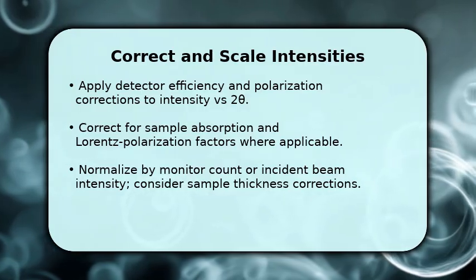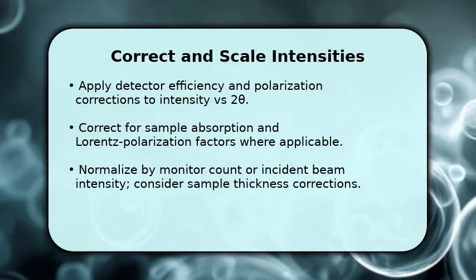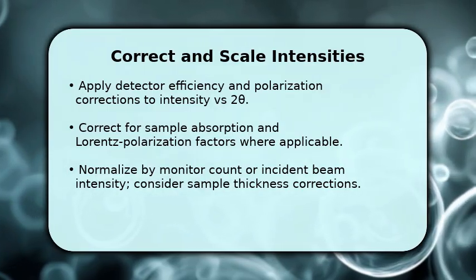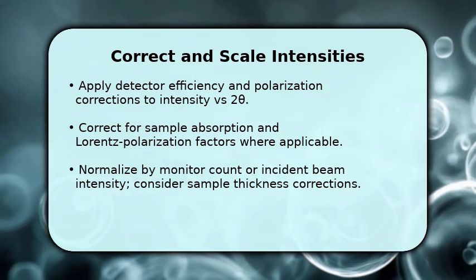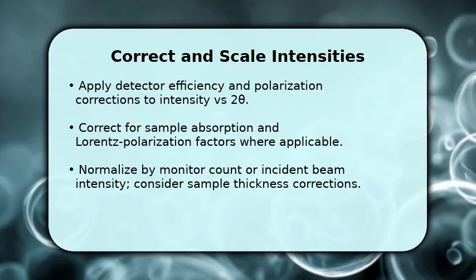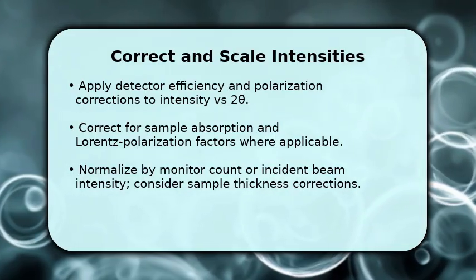After those are applied, scale the entire pattern by a stable reference: monitor counts, incident beam intensity, or a reference peak. Once scaled, peaks reflect intrinsic scattering power. Make sure to document each correction factor for reproducibility and future adjustments.